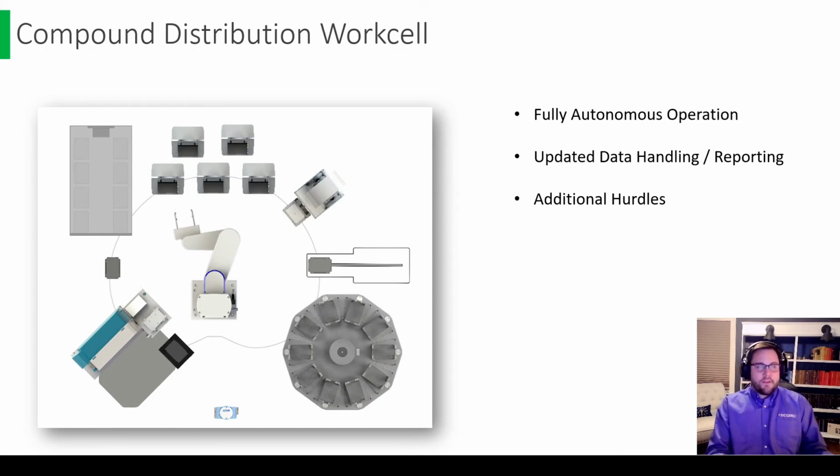All of that, again, was driven by a network-based database that this system needed to contact, and once Windows 7 was sunsetted, it couldn't contact that database anymore, so we went back and reintegrated this whole process with GBG again. The main thing worth noting about this system is that it's fully autonomous, runs 24/7, there is no user input. It just silently takes requests from an internal portal developed by that customer's IT department to allow them to place orders for different compounds, and this system plates them out after a different process further upstream from itself.